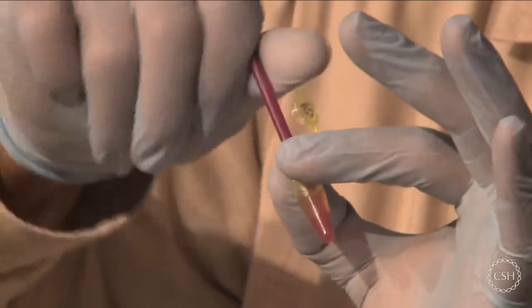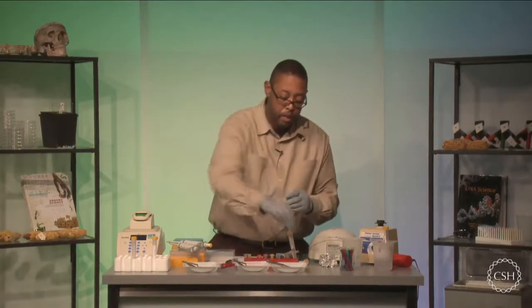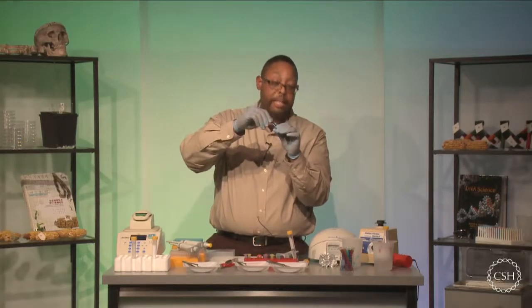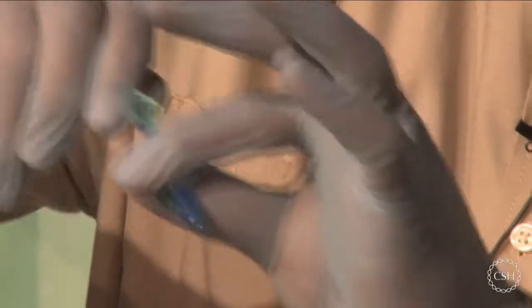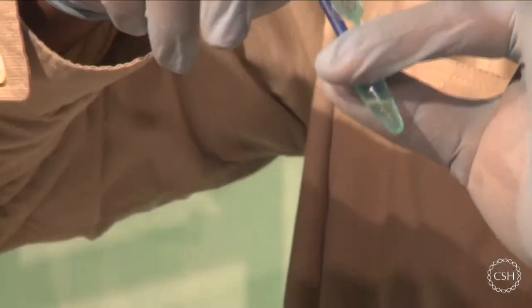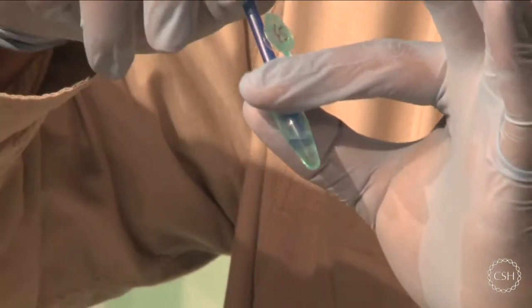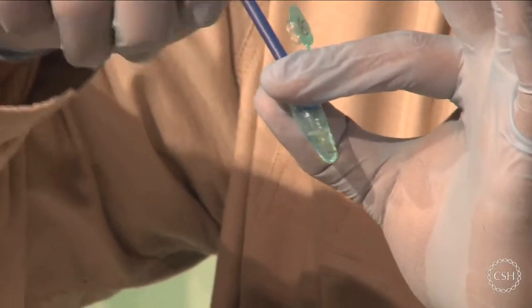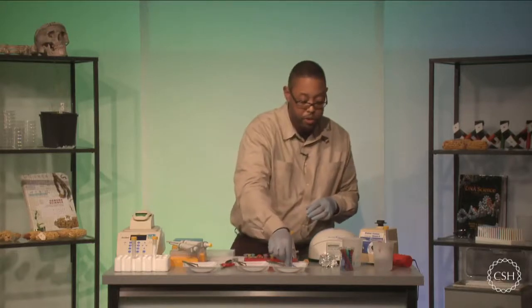So once I've ground up the tissue, and I can see that it's broken up pretty well, I can then stop and move on to the next sample. So I'm going to do my insect last. The insect legs like to float, so please make sure you push all the legs down to the bottom, and then press really hard and grind. Please make sure that you break up the insect leg rather well, because the exoskeleton is a little rough. And once you can see that it's broken up pretty well, you can stop and then move on to the next step. I'll take this and push this down.